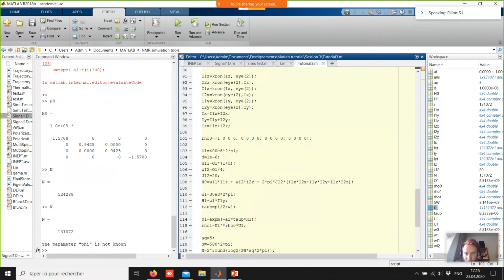No, they are not, because they have a factor 4 in frequency. The thing is, I have chosen a density matrix where both spins are fully polarized. And you don't find this in reality. So it means that your proton spin that sees a carbon spin that should split it in two only sees a carbon spin polarized along alpha, and then you only have one of the peaks of the doublet.